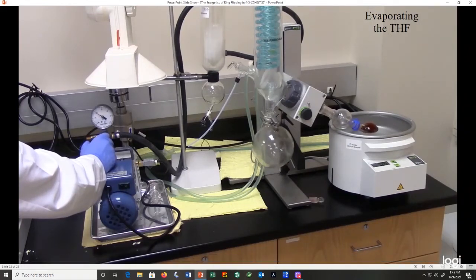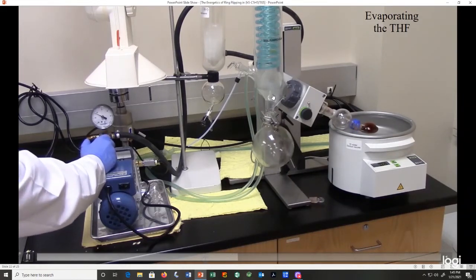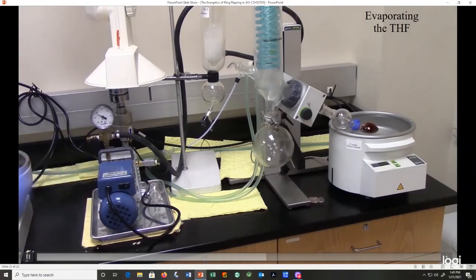So right here you can see that we're starting to get some condensation. So we're right about at the sweet spot to where we've reached the boiling point of the THF at this temperature, and we can slowly start getting the vapors to come up through here, condense on the cold finger, and drip down into this flask here.